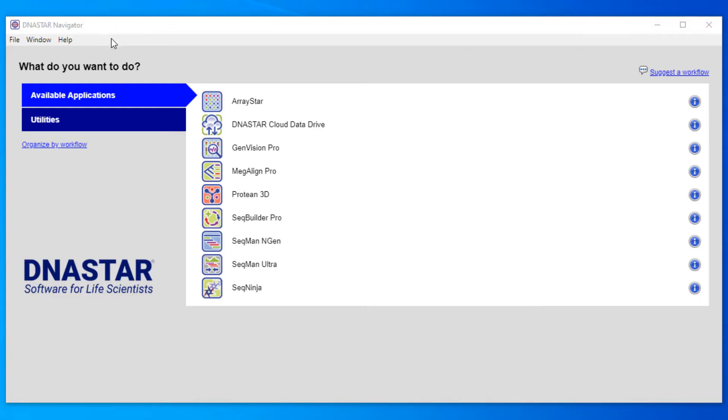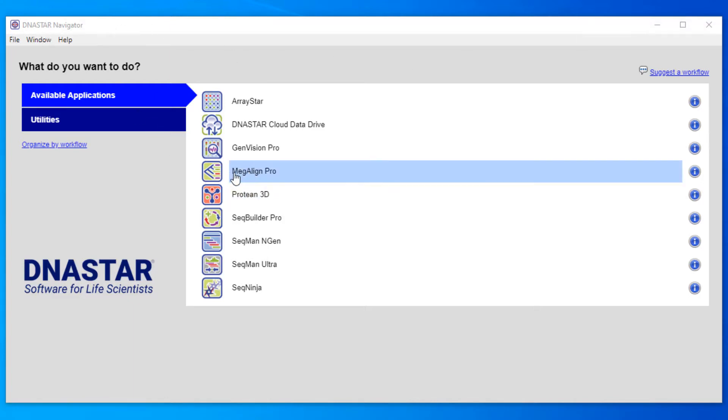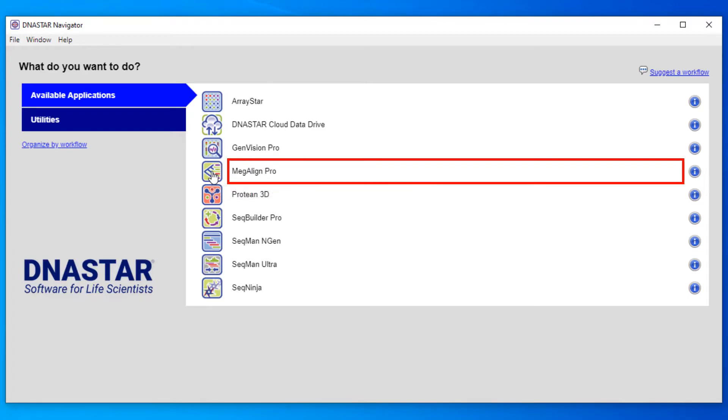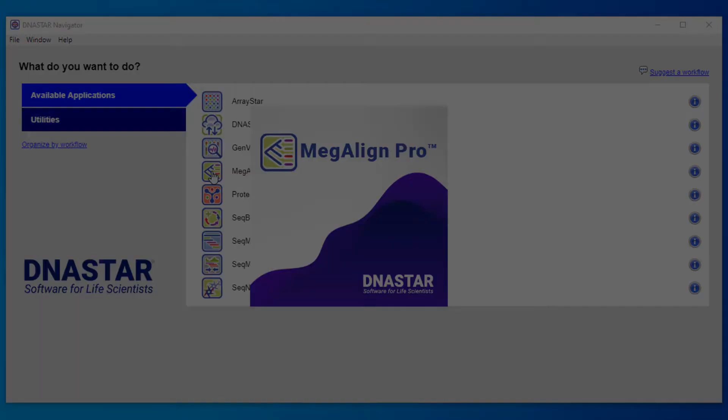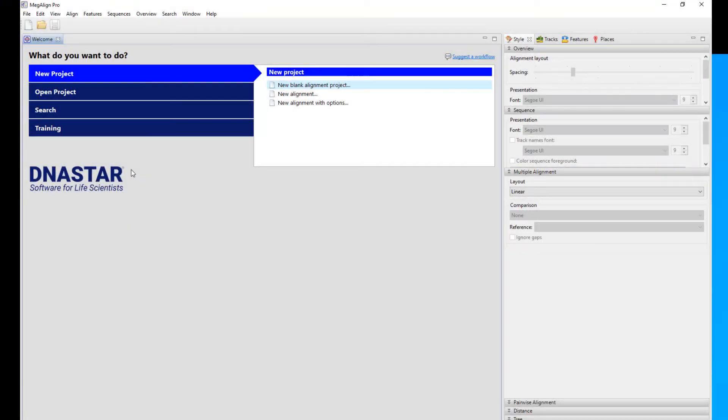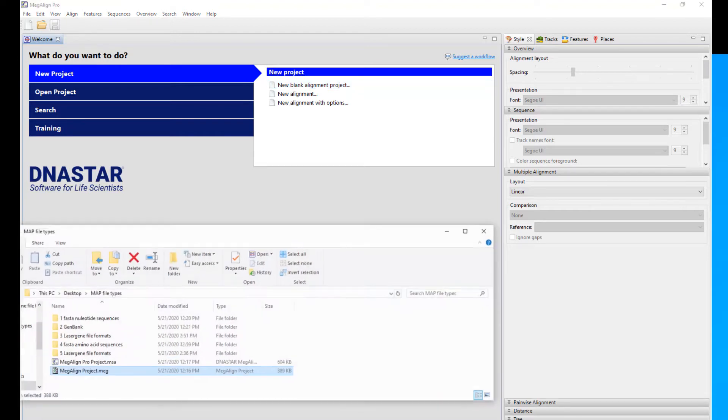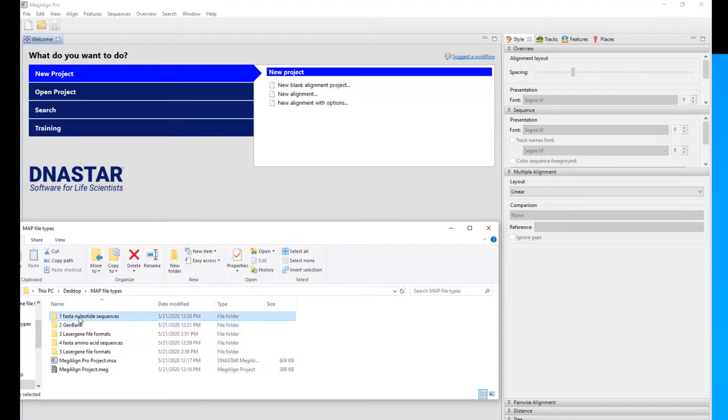Before I get started, I'm at the DNA Star Navigator and I'm going to launch the Megaline Pro application. So probably the simplest way to bring in files in any of our applications is just to drag and drop them right into the application itself.